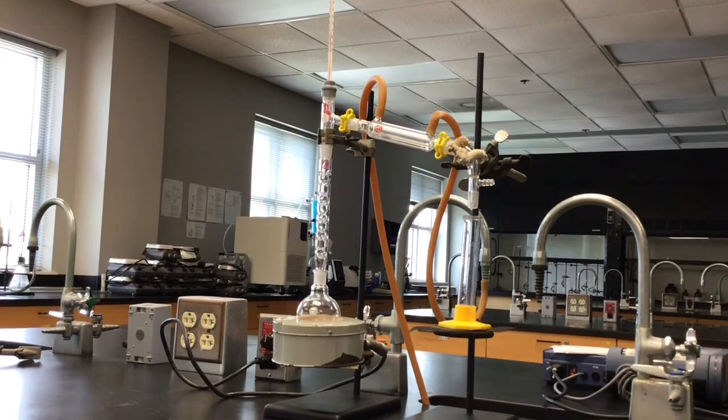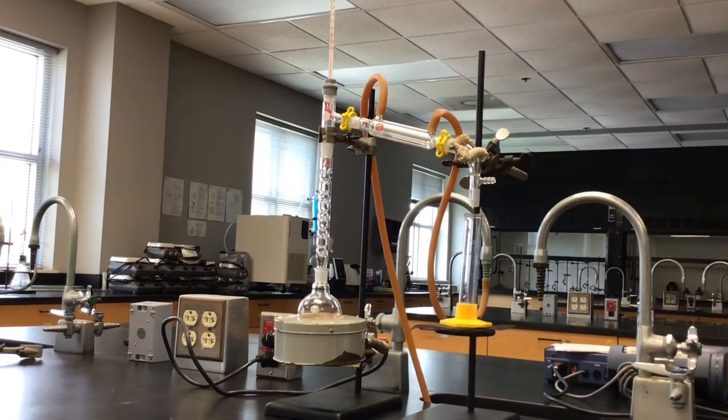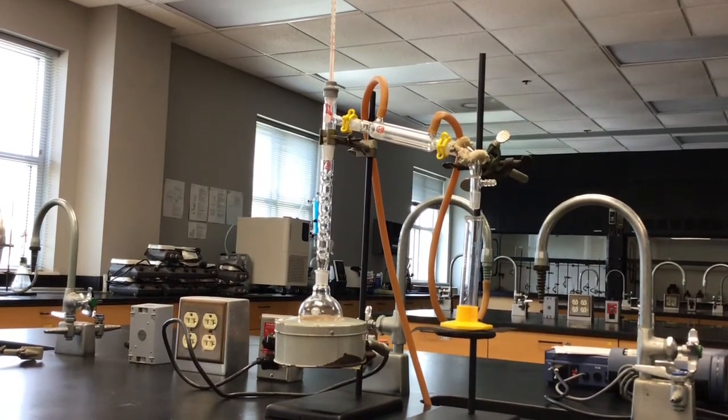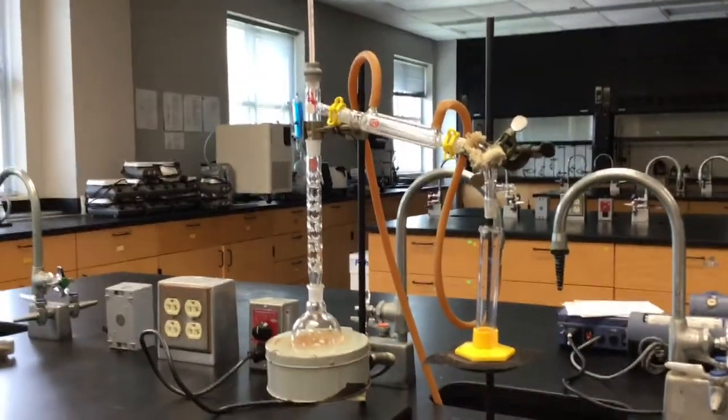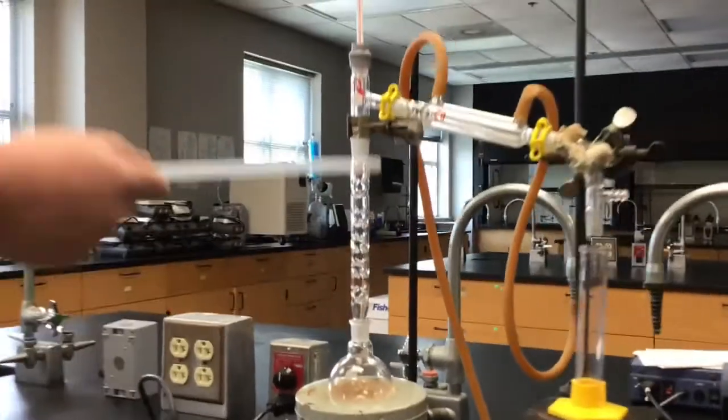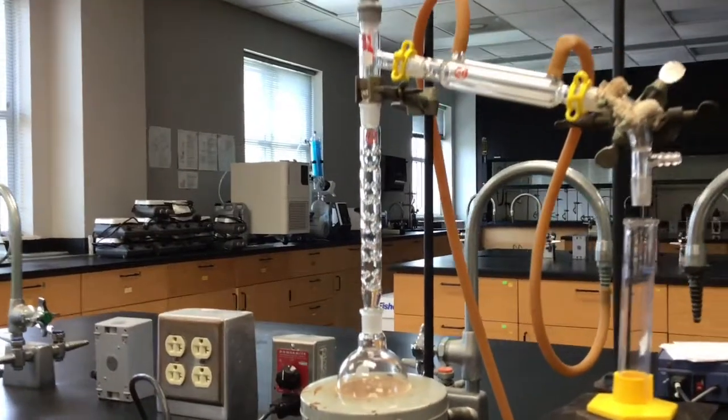In a distillation, your lower boiling point liquid will get distilled first and the higher one will remain in the pot. The main difference between simple and fractional distillation is the introduction of this piece of glassware right here, which is called a fractionating column.